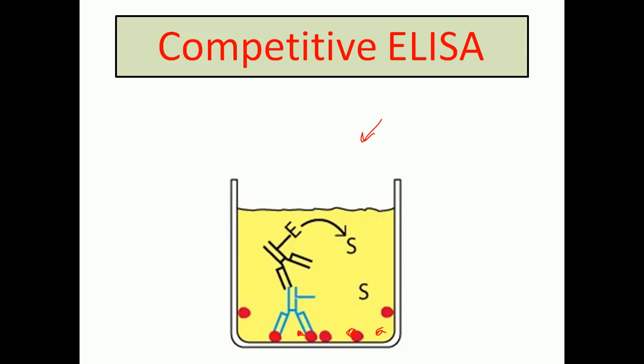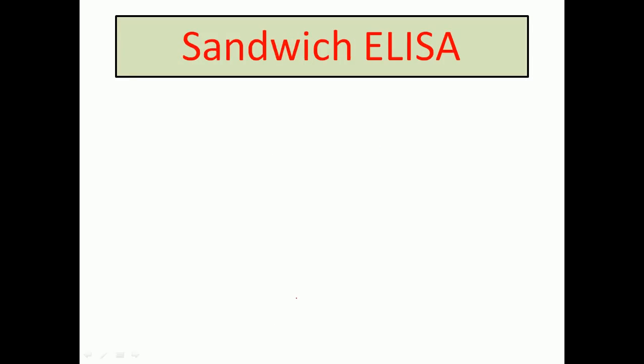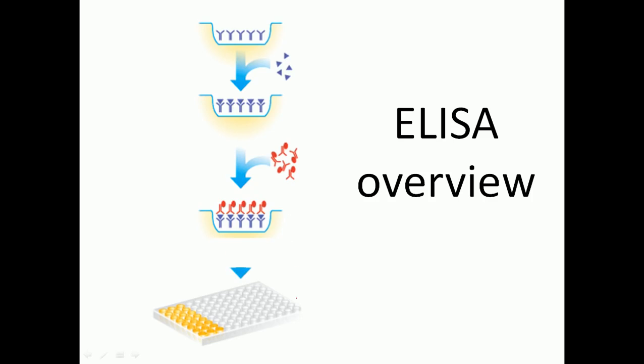So what we can do here, if we start looking at the wells of ELISA, you can see in these wells, for example, throughout the wells we do a twofold dilution from one end to the other. That means from the first to the last well, there will be twofold dilution all over. What twofold dilution is we'll talk about in other videos. But the thing is, we are diluting the sample.